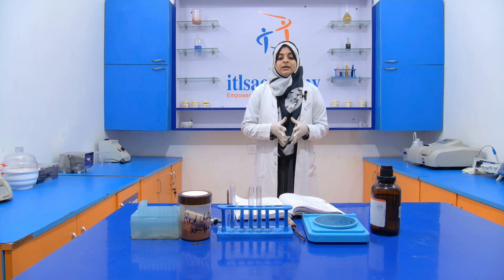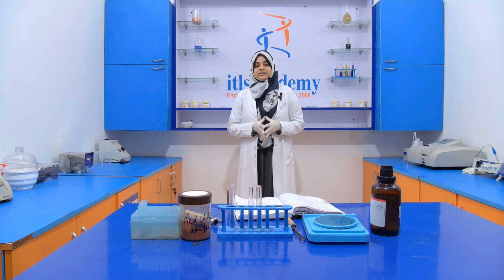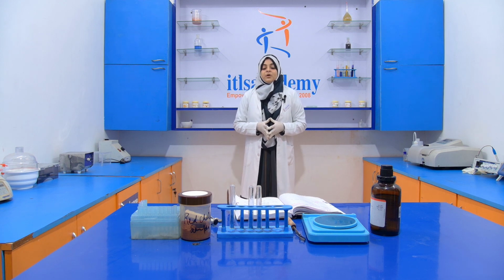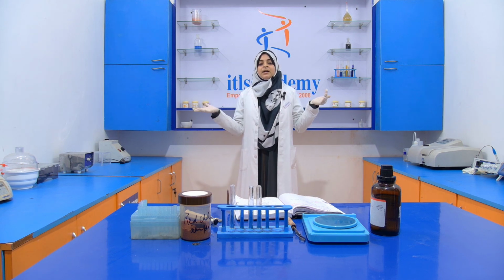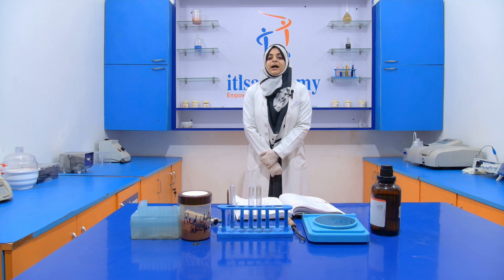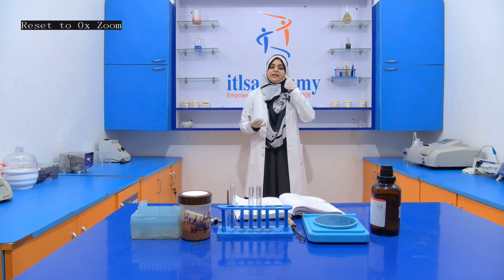Okay, here the main aim of adding rhodamine B into a chili powder is to enhance the color of the red chili powder. We all know that the color of a food product is due to either natural or artificial coloring. When it is natural, it does not create any problem, because it is natural color. So when we consume a naturally colored food product, it does not cause any health issue.